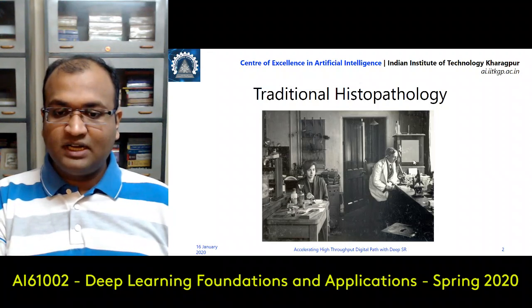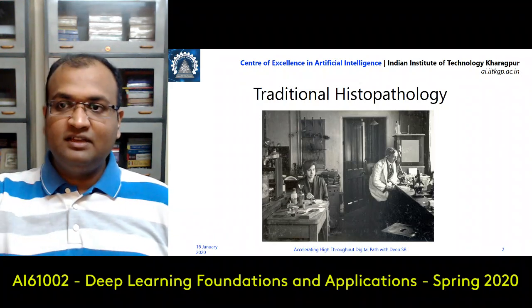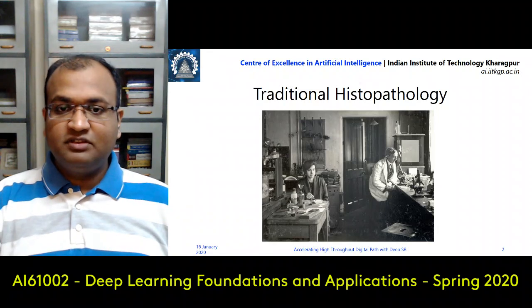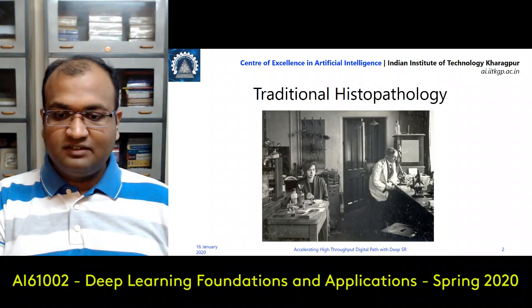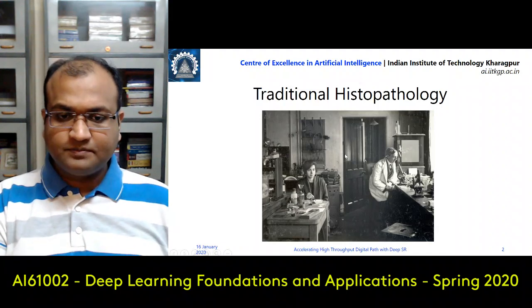Now what our task over here was basically that this guy wants to look at something at micron levels. So say your lines are closer to each other at a spacing of 1 micron or 2 micron, and now he wants to discriminate between them. The only way you can do that is using your fundamentals of optics of lenses. So let's get into that one.